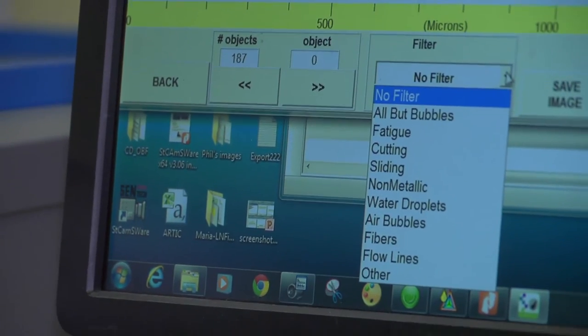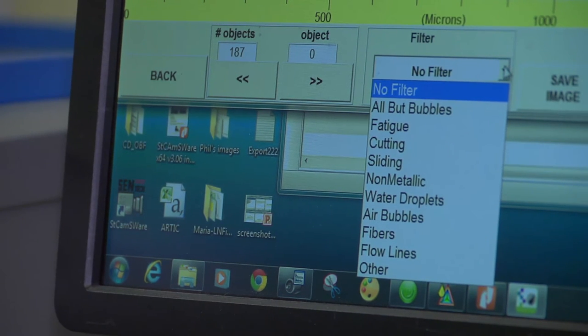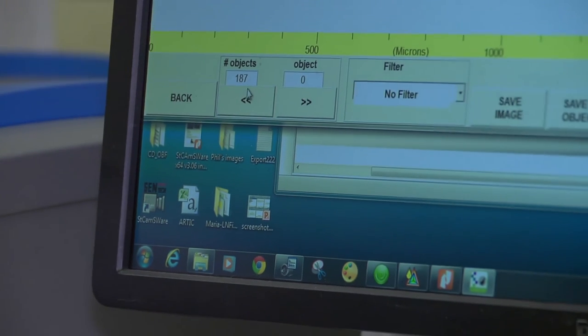water droplets, fibers, air bubbles, et cetera. One can actually print out these image maps. You can see in that sample there's 187 images. Again, that's 187 particles larger than 20 microns.